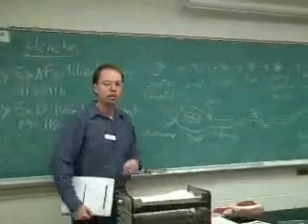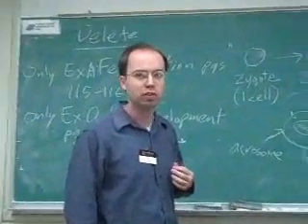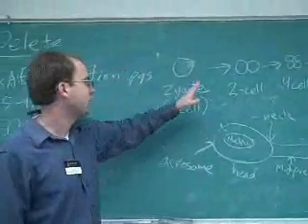The next thing you looked at was starfish development. I've drawn it out on the board, so instead of looking at the slide, I'm just going to look at it on the board where it's labeled. Come over with me. You should make sure that you can recognize all the stages of starfish development and know their parts. Okay. The earliest stage of starfish development is the zygote.